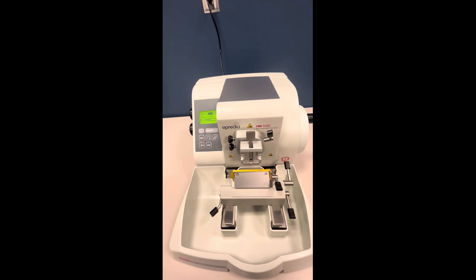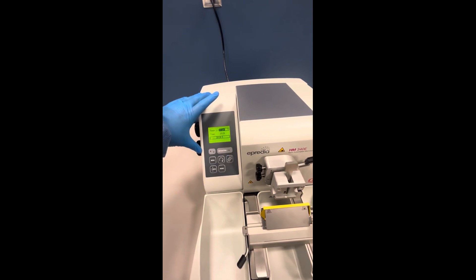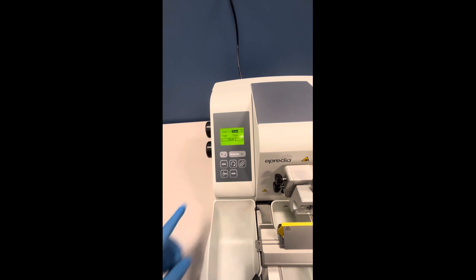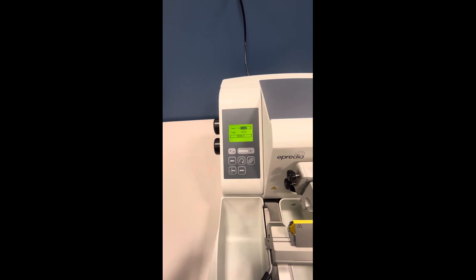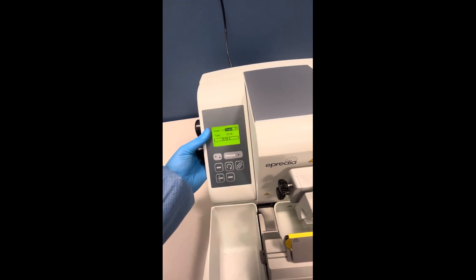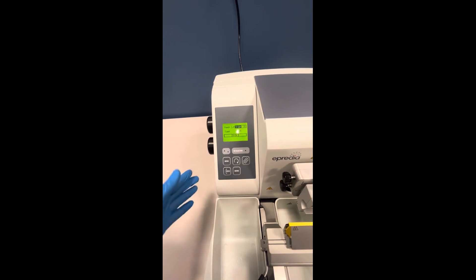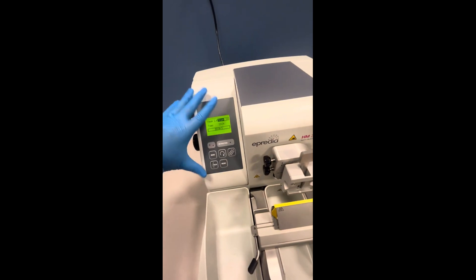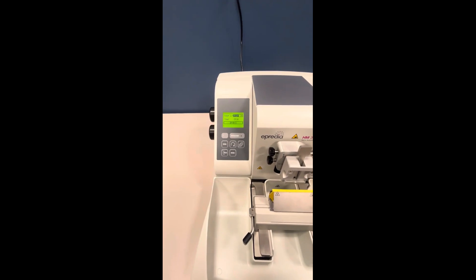Let's talk about the different parts of the microtome. This section here is called the operating panel, and it has a touchpad keyboard for easy use. You can actually leave the operating panel on the microtome when using it, or you can remove it and put it off to the side. We'll talk more in detail about this operating panel in a little bit — that's called the operating panel.